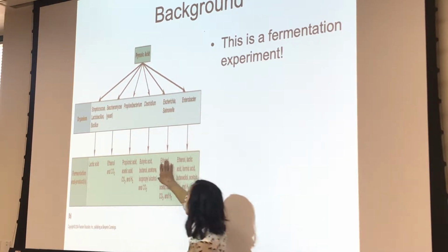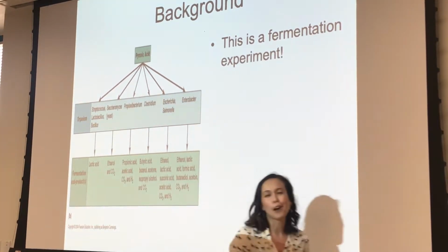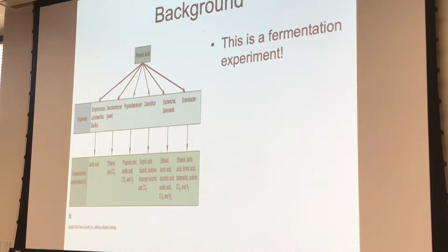Of course there's the type of alcohol you drink, but then there could be other types of alcohol. Even with the gas, there's not as much variability, but technically it could be carbon dioxide gas, it could be hydrogen gas. It just depends on the genetic makeup of the organism. So the end products can vary a little bit. All we're going to do is exploit that in this lab. So we're going to look for mixed acids, and then we're also going to look for the alcohol.